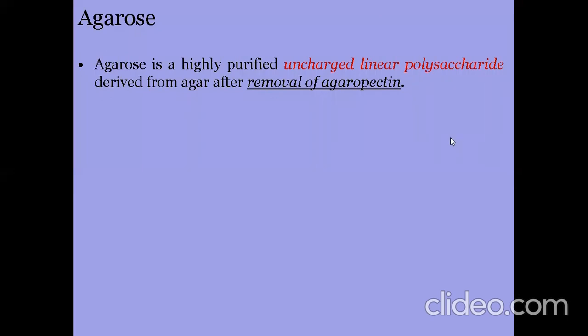Okay, agarose is a highly purified, uncharged linear polysaccharide derived from agar after removal of agaropectin. So agarose is purified and uncharged, so it will have no charge.